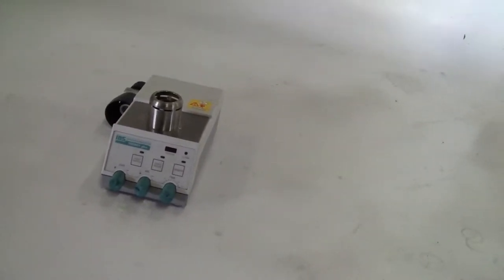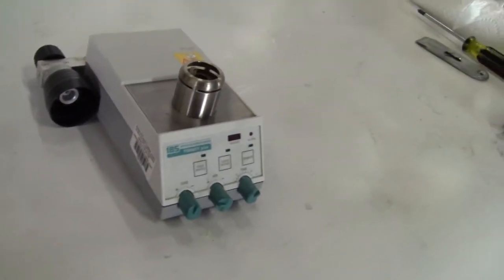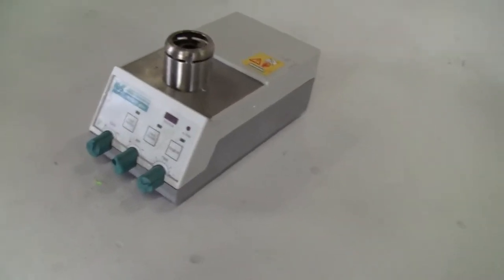Hi, this is Jim from High Tech Trader. We're looking at the Fireboy Plus for Integra Biosciences. It's a Bunsen burner. We don't have any gas here, so we can't hook it up and run it for you, but I'll show you some of the features.